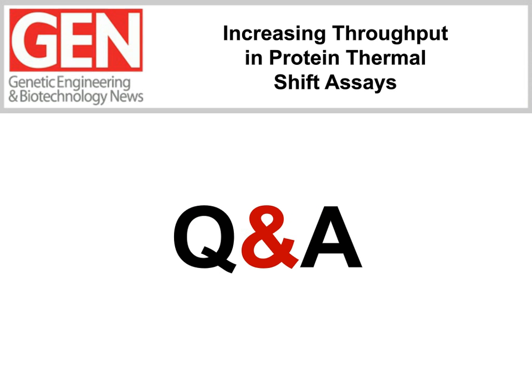Okay, so just before we get to our first question, I'd like to go over the polling results that we had during the talk. For the first poll question, we had asked everyone, are you currently performing thermal shift assays? And 66% of you said you weren't. 33% said you were. Of those that were doing thermal shift assays, about 50% of you said that you were using 384 well format, almost 40% of you said the 96 well format, and then the rest evenly split between 1536 or greater. And then the final question is whether or not you were interested in increasing throughput for your assays and whether that was important to you. And almost 52% of you said they were.